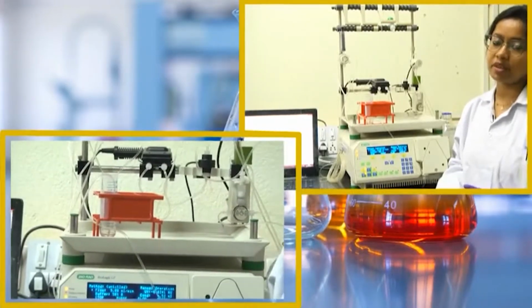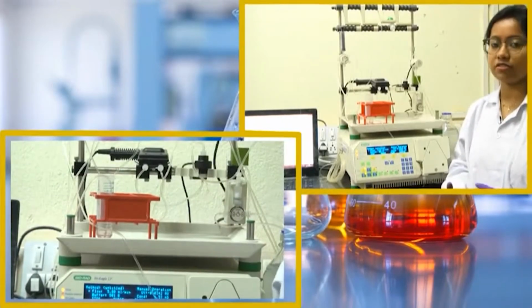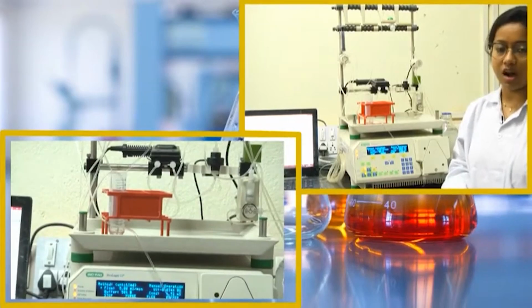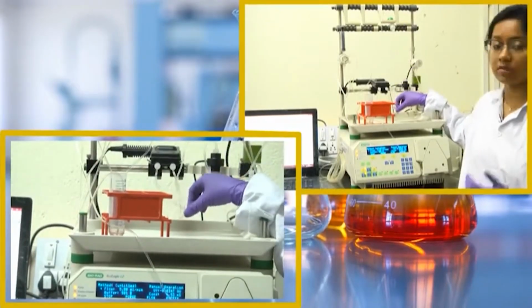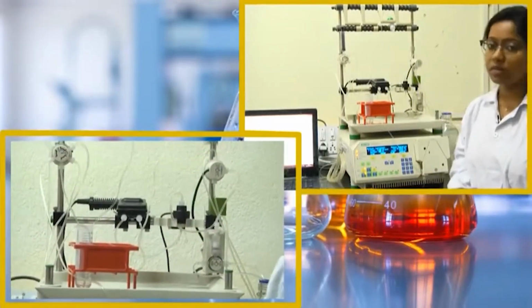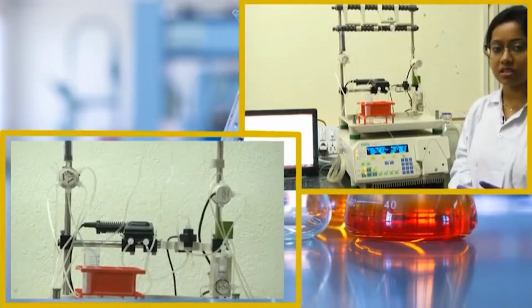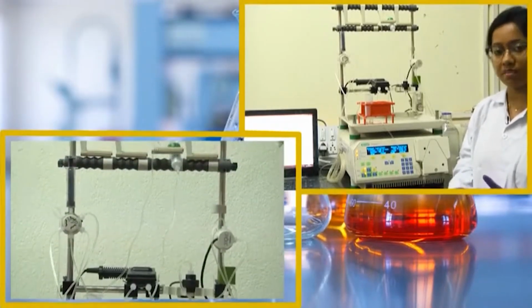Salt will be there, as I have mentioned earlier, because proteins are stable in a particular salt environment. If you have too low or too high a salt concentration, the protein might precipitate out of your solution, and if it precipitates inside the FPLC system, it might clog up the whole system, as well as your column. So, 200 millimolar salt is present in our case. If you need, you can change the salt concentration based on your requirements, as it might vary from protein to protein.